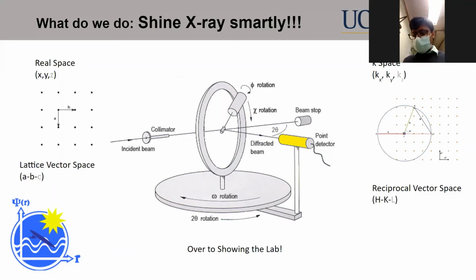Okay, so this is just ensuring that you correctly made the material you set out to make. Absolutely, and also figuring out if you have an unknown material. For example, there are complicated materials where you cannot define the lattice spacing so easily, in a direct way. Like quasicrystals, where there are some weird things happening.